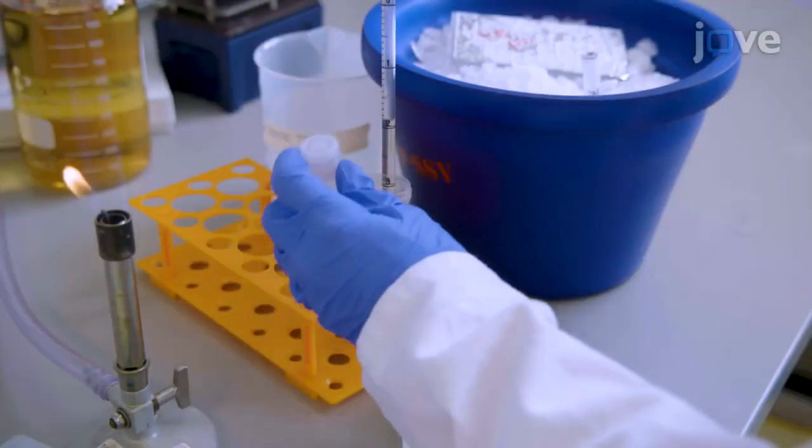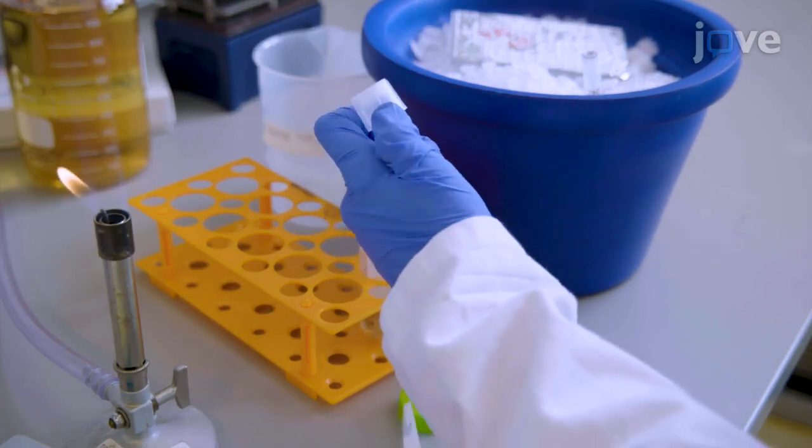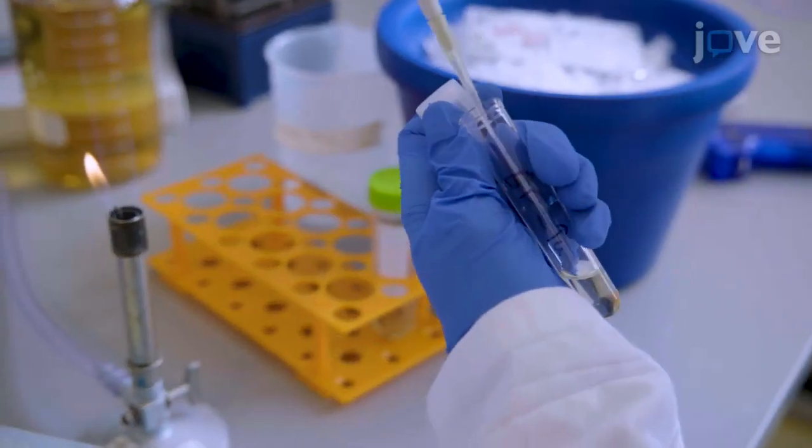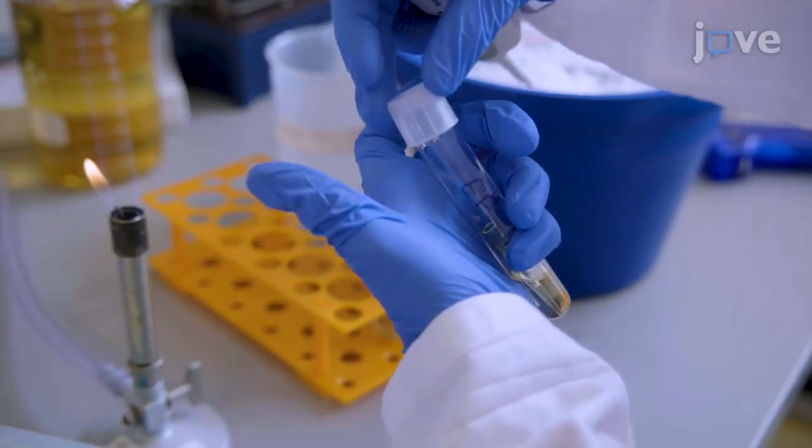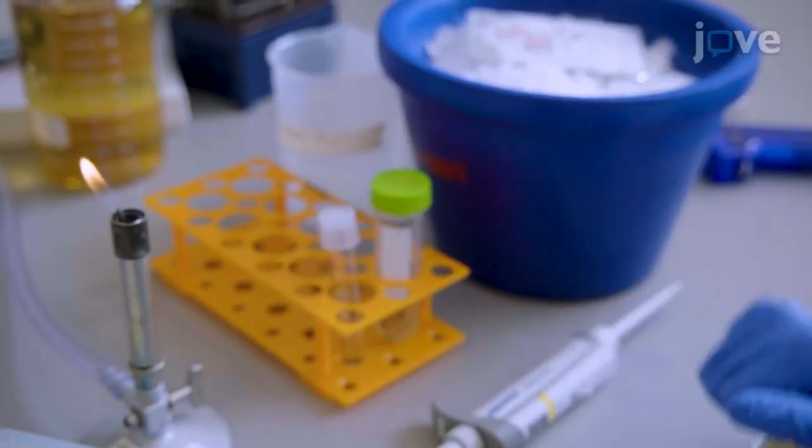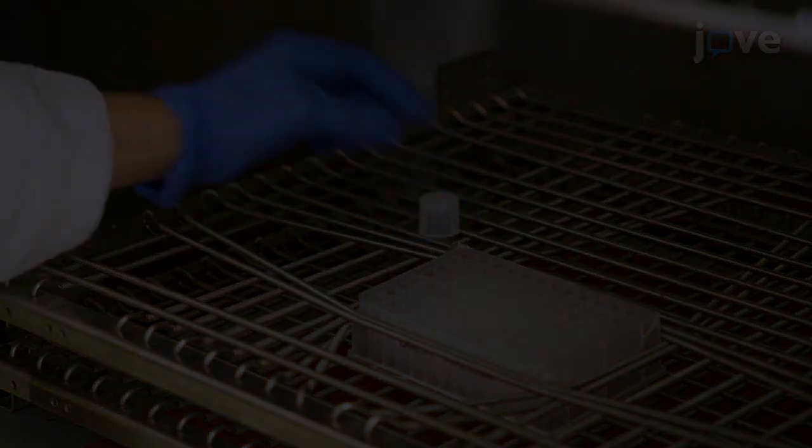For the EF-TU culture, inoculate 3 mL of ampicillin-containing LB media in a 14 mL culture tube with a snap cap. About 3 mL of EF-TU culture is sufficient for one one-pot expression culture. Incubate it at 37 degrees Celsius while shaking at 260 RPM.